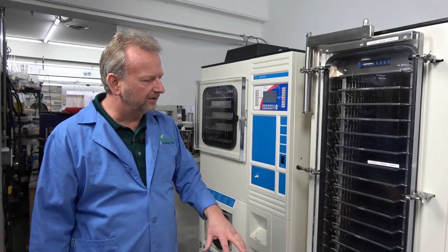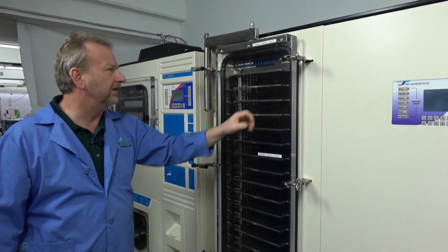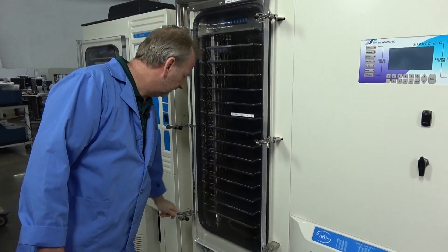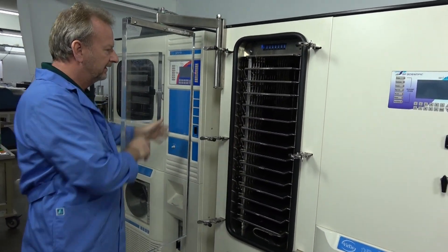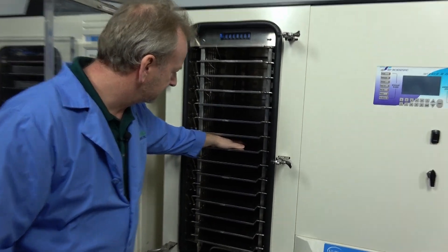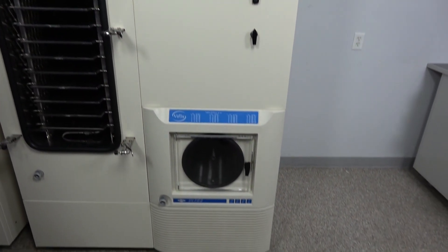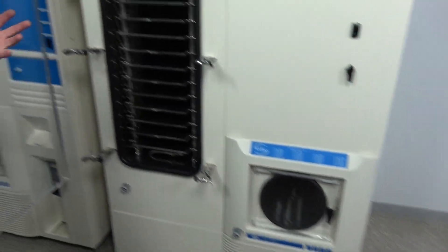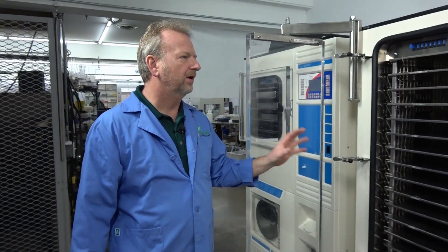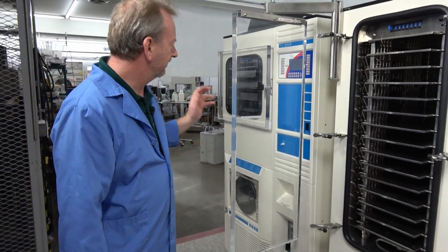This Ultra has a big swing-open door that gives you plenty of room to get in and fill up all the trays. There's plenty of room in the condenser too — you can run this one for days on end with no problem, freeze drying a lot of samples. This would be the last step before moving to full production scale.